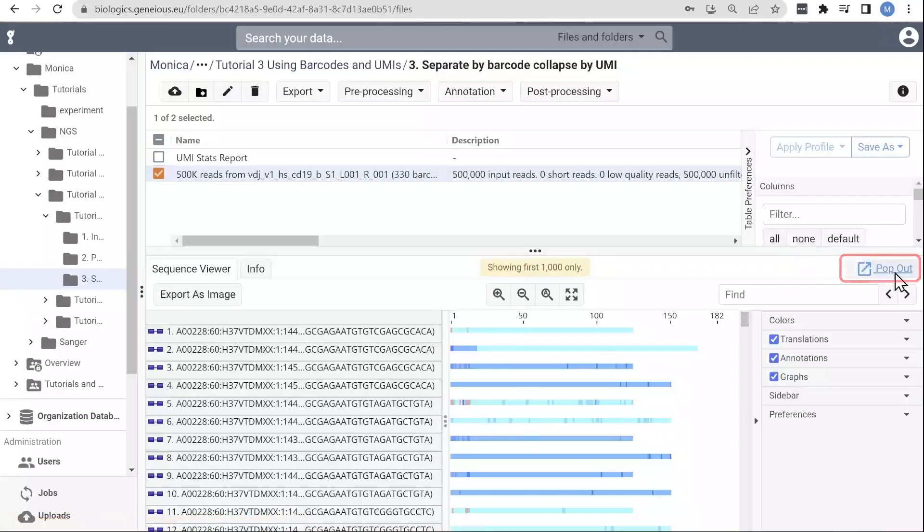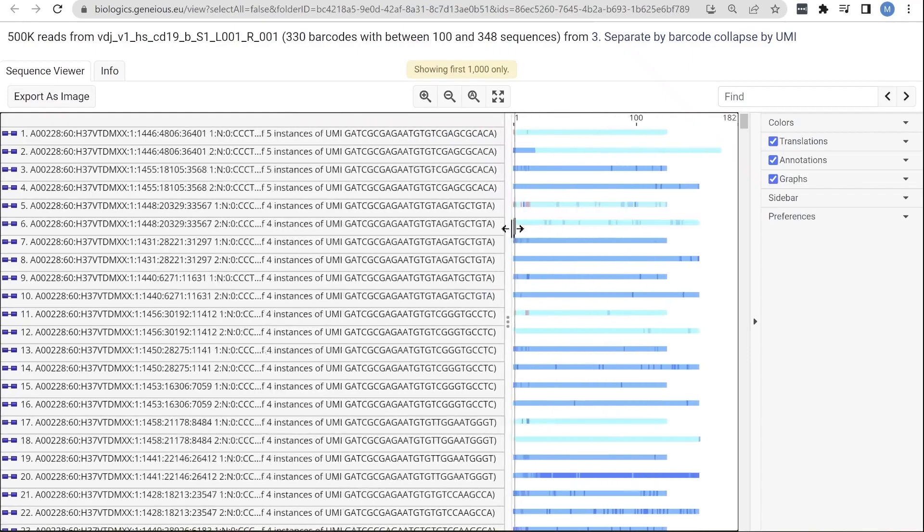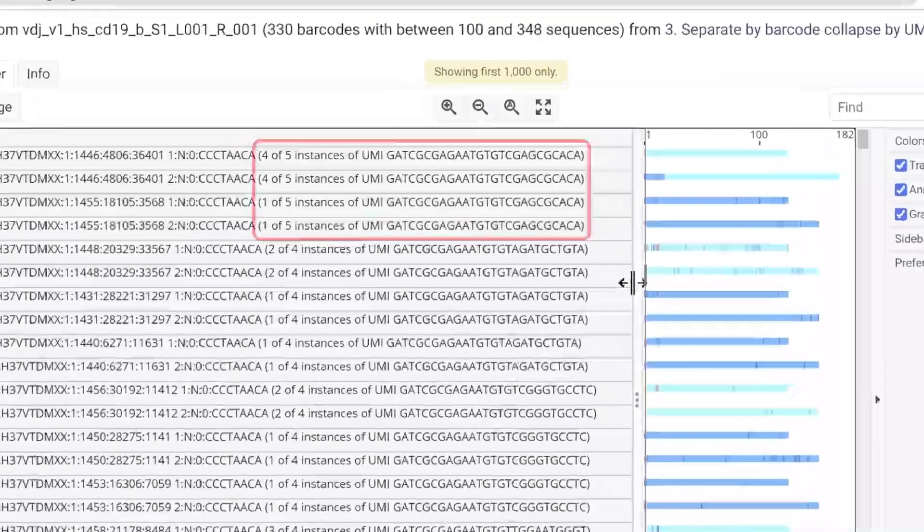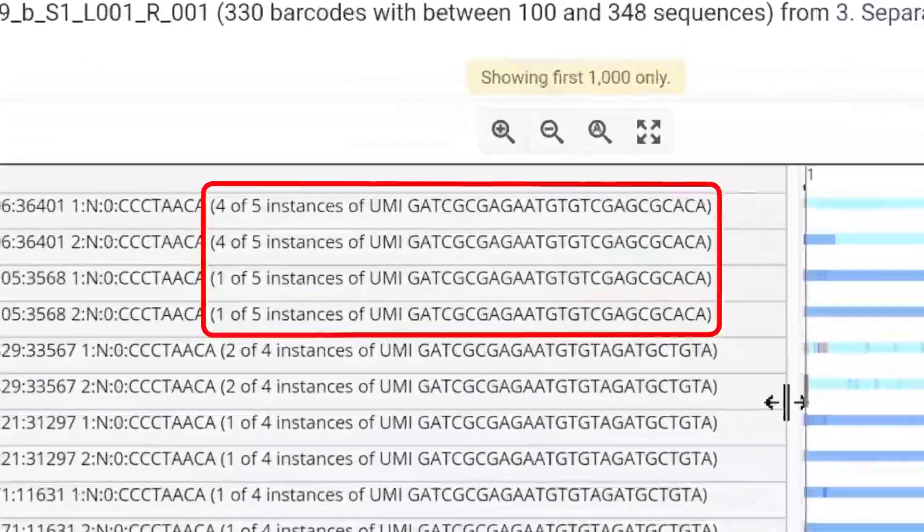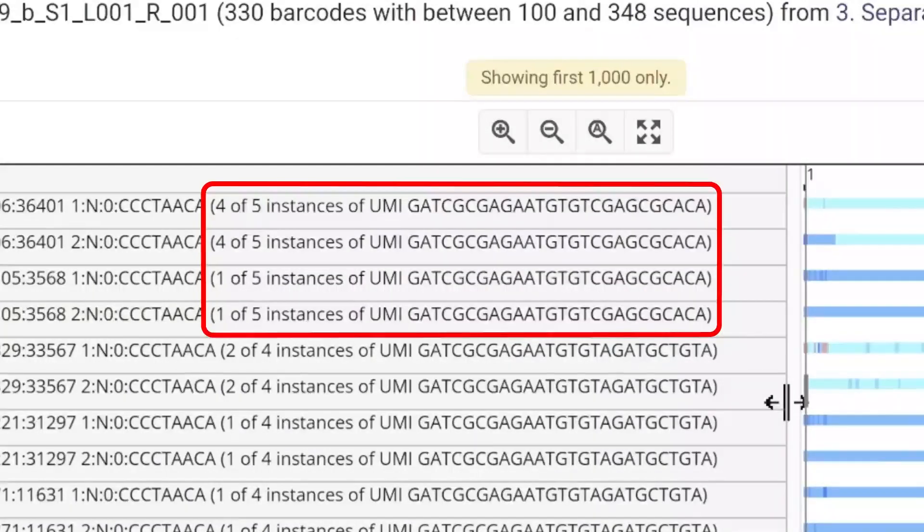Let's take a look at our results. You can see in the sequence name here the barcode indicated, and the UMIs detected with that barcode. For this barcode, there were two sequences with the same UMI, one with four read pairs, and one with one read pair.